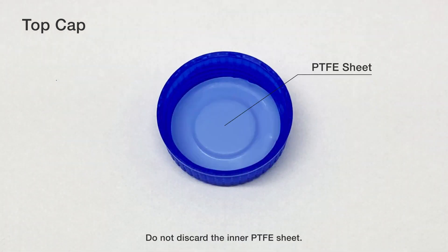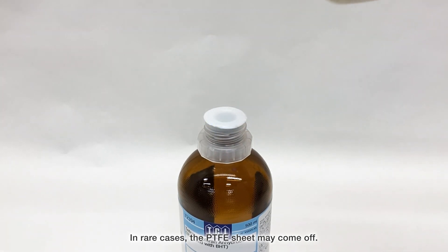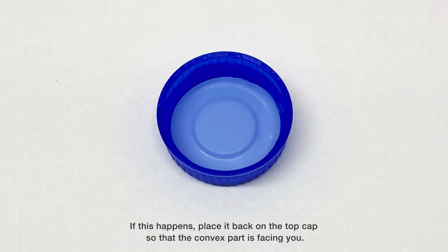Do not discard the inner PTFE sheet. In rare cases, the PTFE sheet may come off. If this happens, place it back on the top cap so that the convex part is facing you.